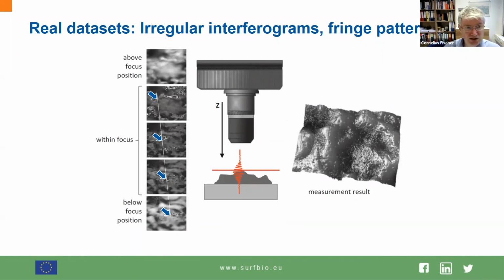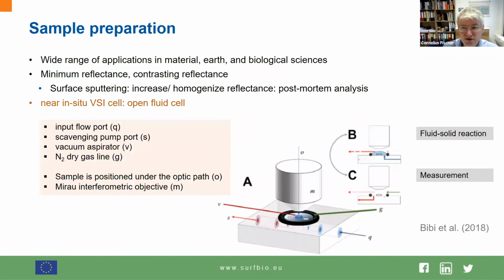And this sequence of fringe patterns is stored and analyzed for the differences in the fringe pattern, the differences of the distance of the fringe pattern for each pixel. And from these differences in distance, the height differences are later on calculated.